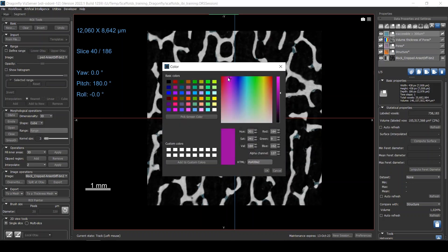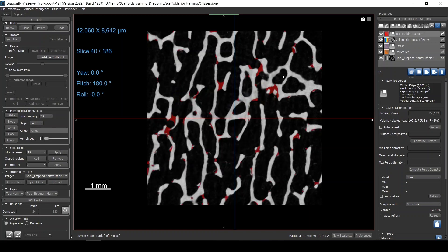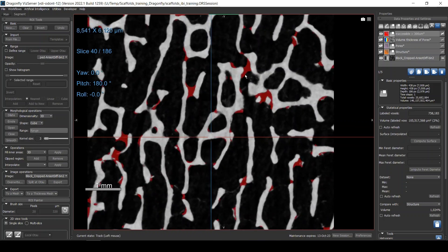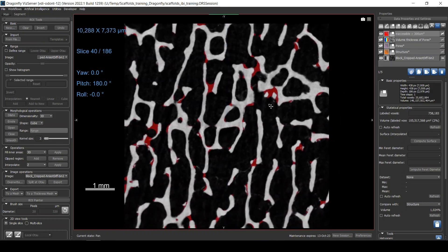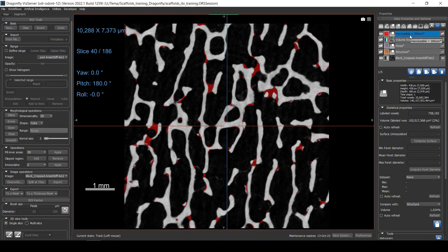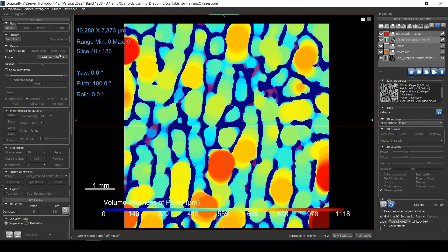I'll call this region 'inaccessible for larger than 300.' Let me give the scaffold a visible color so we can see it clearly. Now I can see the regions where, with a size of 300 micrometers, nothing can access — if you had a large cell 300 micrometers in diameter it couldn't reach those highlighted areas. Let's try another example: define the range from 1 to 500 micrometers to see what's inaccessible for objects larger than 500 micrometers.